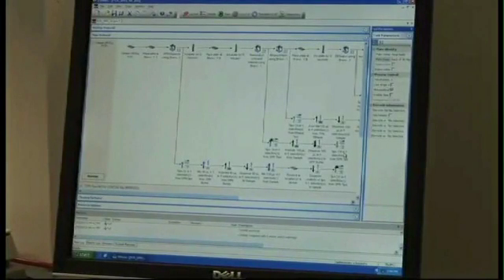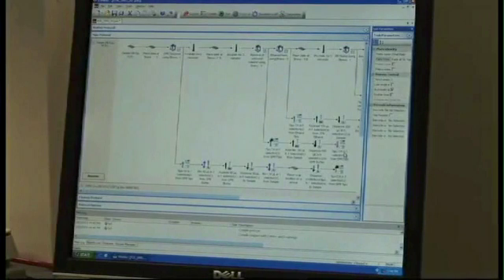This is what a typical protocol looks like using the Bravo automated liquid handler, controlled by the V-Works software. Everything seen done manually will now be done on the deck. A typical workflow is that the user loads up all the specific tips, reagents, and samples into their proper positions on the deck, opens the appropriate protocol, and hits Start. The protocol runs for approximately 25 minutes, after which the cleaned sample will be in the 2D matrix bar-coded tubes, ready for further quantification or registration.